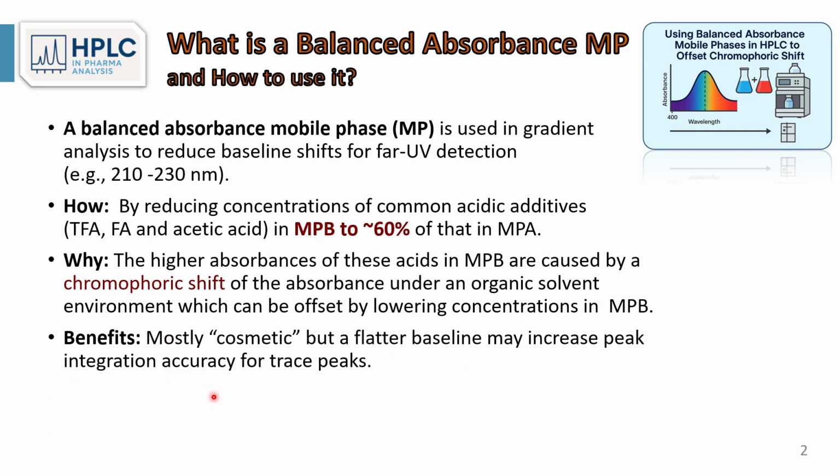Now, the benefit of using a balanced absorbance mobile phase, admittedly, is mostly cosmetic. However, there is a real benefit, since a flatter baseline or less gradient shift would increase peak integration accuracy, particularly for trace peaks which are eluting underneath, after the main component.